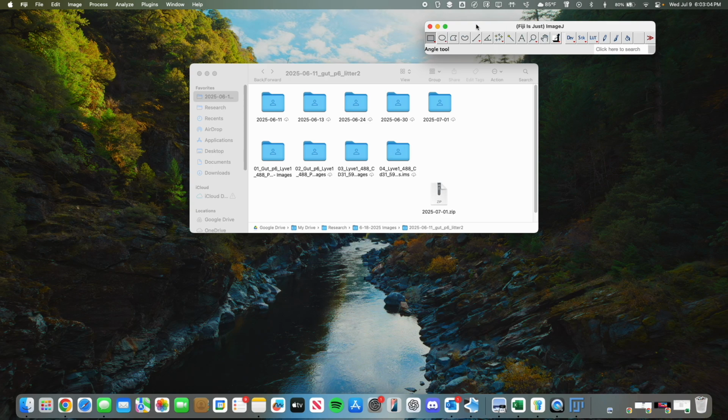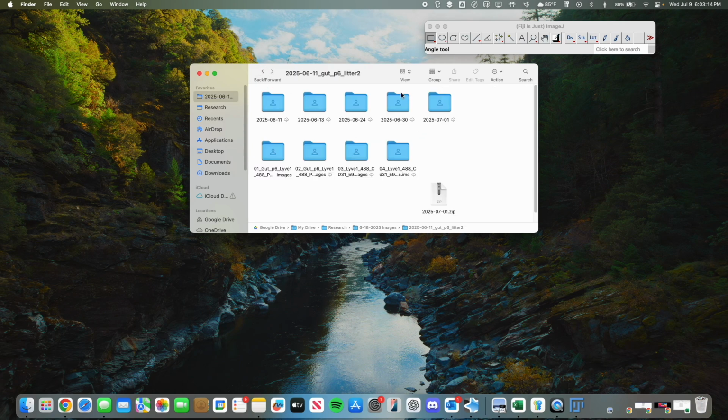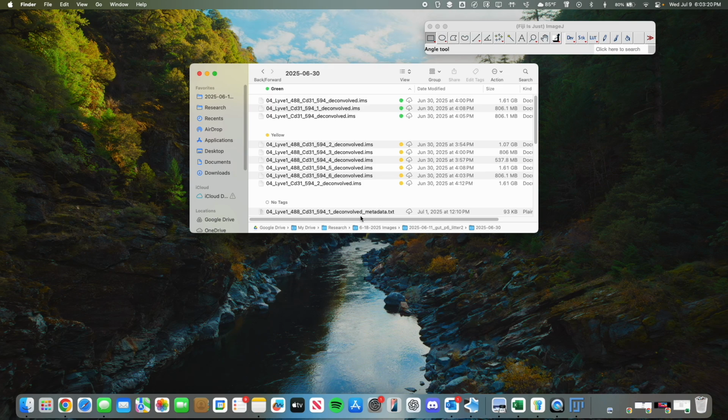When we do this process, the first thing we can do is drag a file directly from this list of files that I have. In my case, I'll be opening up a new file, one which I haven't done, and we're going to try and open it straight from here.